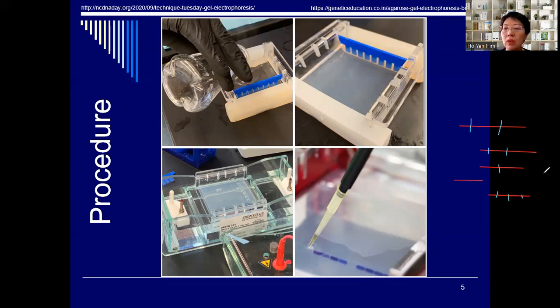Therefore, after you cut the DNA from the nucleus of a person, you get many fragments of different sizes. Then you take this entire sample, which is liquid, and transfer it with a micropipette into the well. Inside each well, there will be a number of DNA fragments of different sizes from an individual or from a sample that they've obtained.